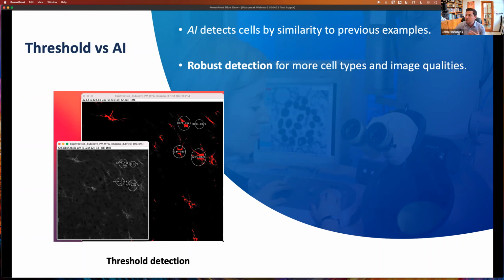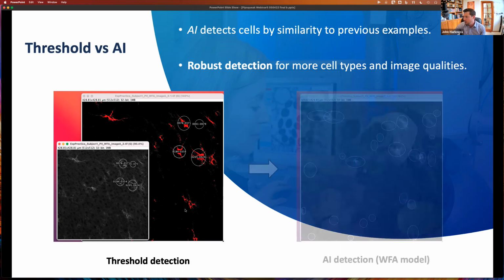So if you've used software like Cell Profiler or Weka, I think there are really great tools to segment an image if you have great clarity and little background, but those approaches often fail when you encounter cells like this that aren't easily defined, something maybe like a microglia. This is a perineuronal net. So there's not an easy boundary to the cell, or there's a lot of overlapping.